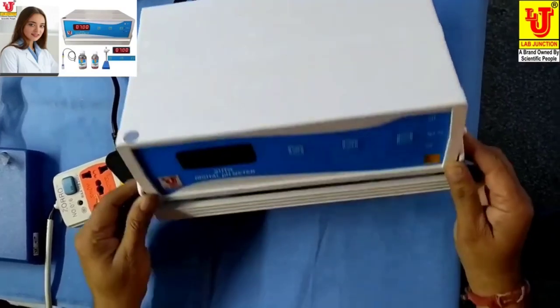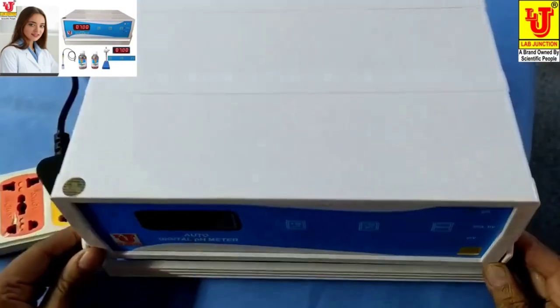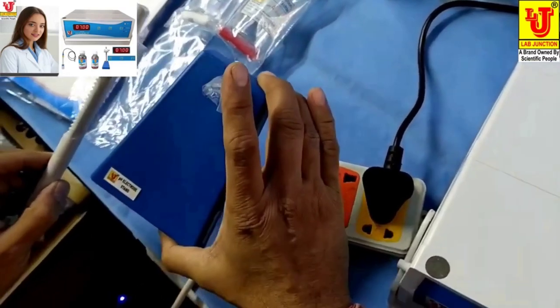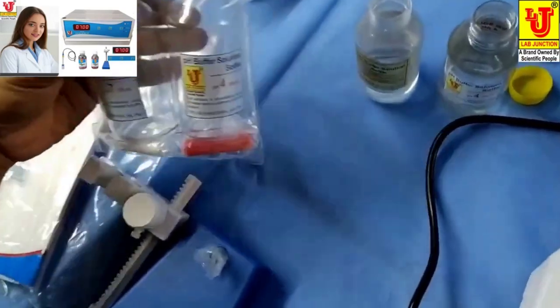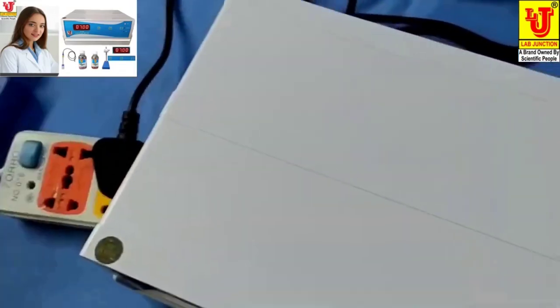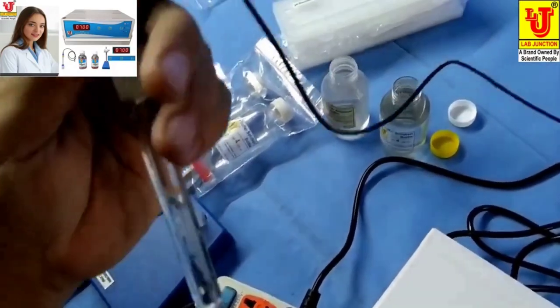Lab Junctions auto digital pH meter, model LJ111. These are the accessories: pH electrode stand, instruction manual, dust cover, warranty card, and pH 7 and pH 4 buffer bottles. This is the pH electrode.